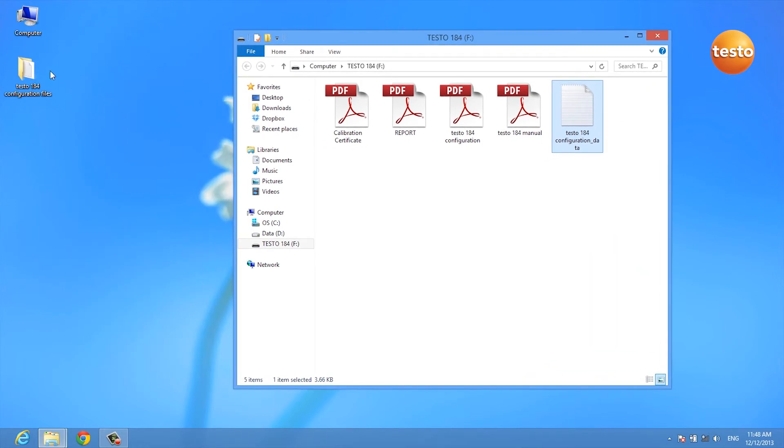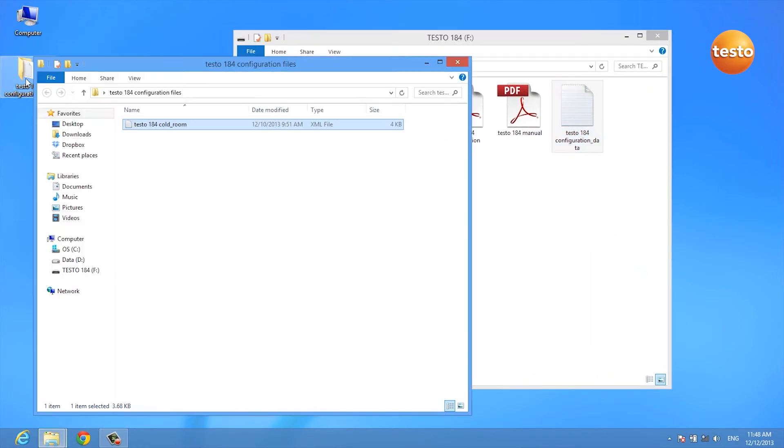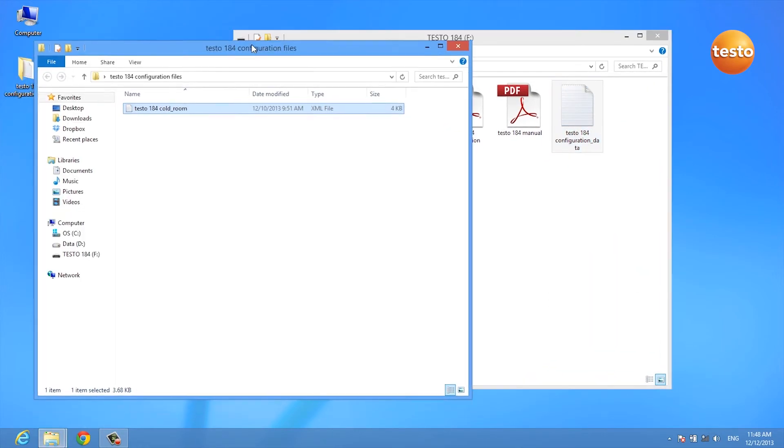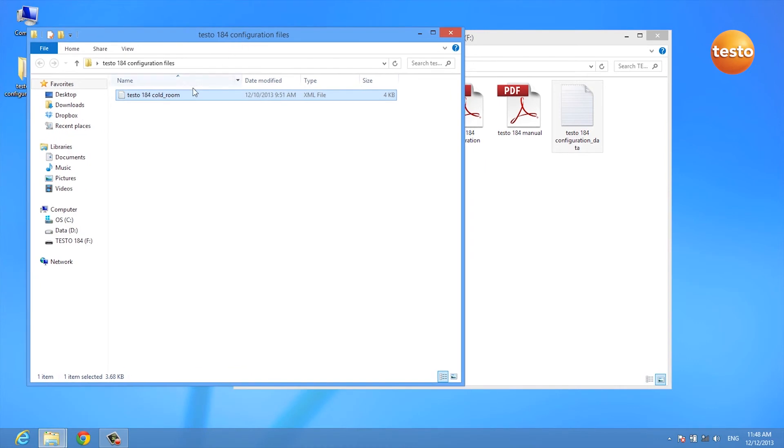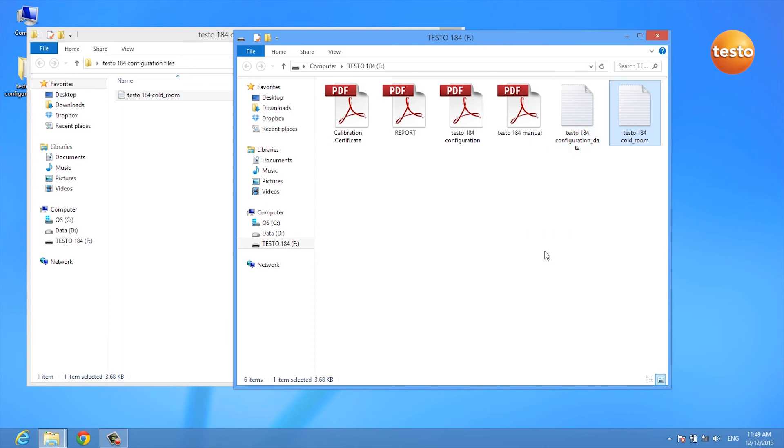If you want to configure several different data loggers with the same configuration file, all you have to do is drag and drop the XML file onto your data logger.